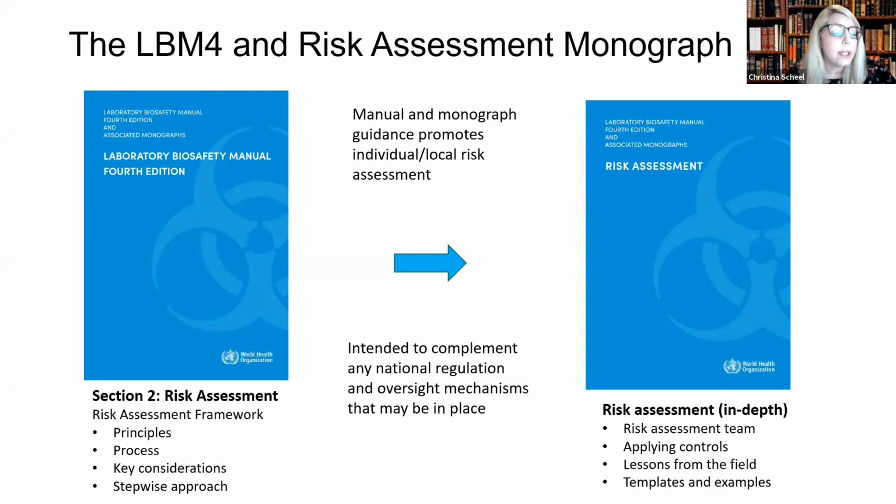So also key considerations for risk assessments and the stepwise process of the risk assessment approach. That is the document that you should first turn to learn about risk assessment. And then for more information and to get complete treatment of the topic, please refer to the risk assessment monograph.